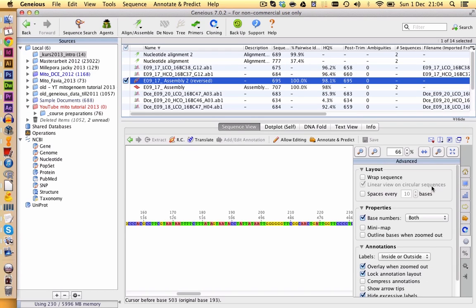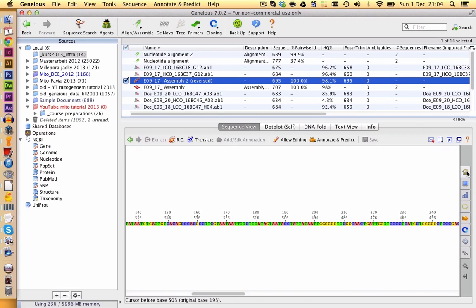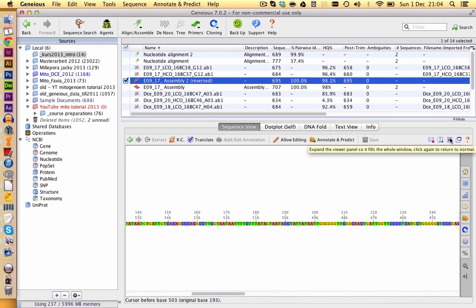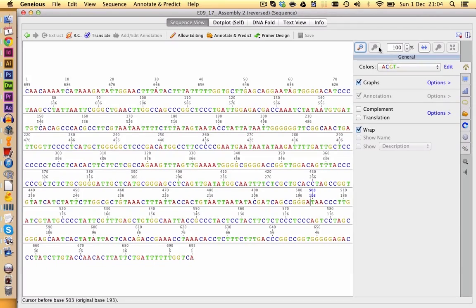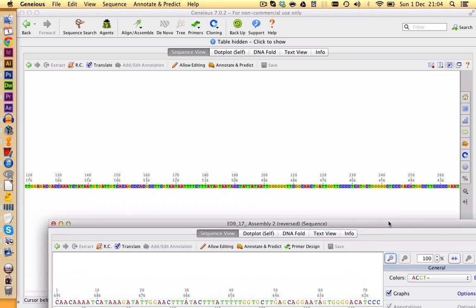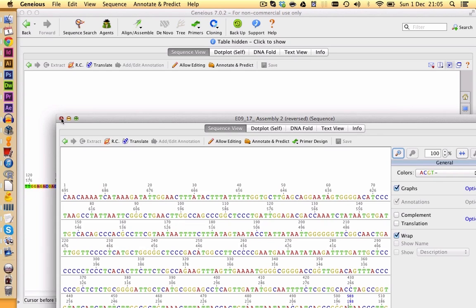If you want to hide this one, you can double click on this one to have it hidden if you need more space. Also, you can enlarge the view of your sequences and you can even make them open in a new window, so you would have several windows open where you can work with several files at once, which is especially great if you work with a second monitor.